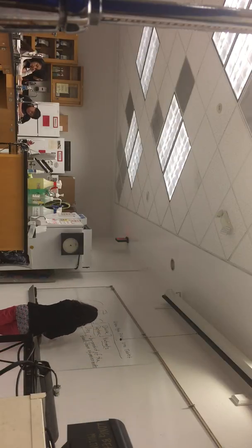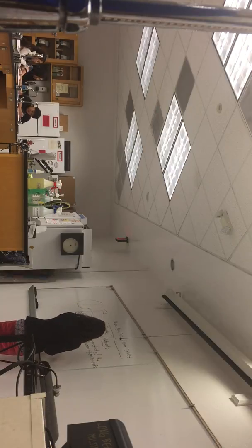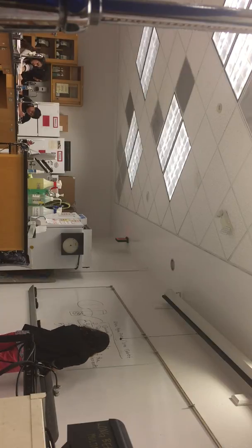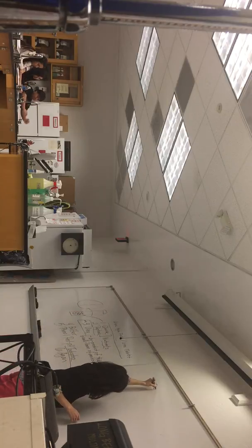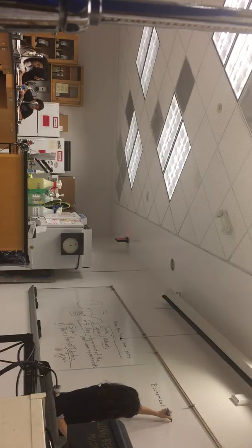And then other than that, there is a little bit of buffer and phenol red, which we've used before. It's the pH indicator. And then other than that, it's just the agar. There is no agar in the tablet, so the agar would only be in the plate. But everything else is pretty much the same. So you guys are going to see if our organism can break down urea.